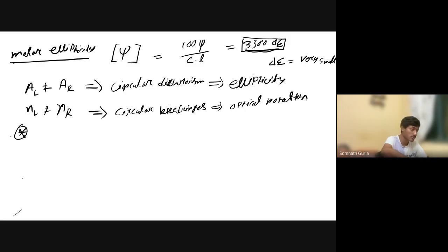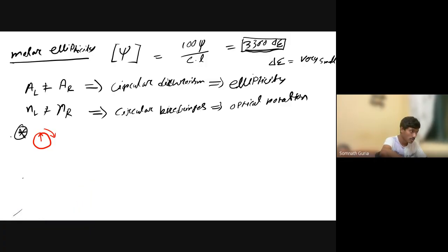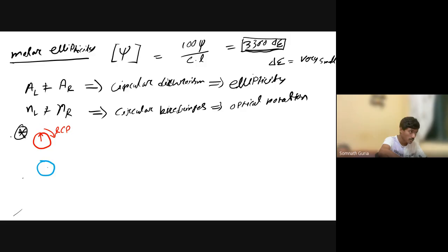So how will it look? We have the right hand circularly polarized light over here, and the left hand circularly polarized light, LCP.